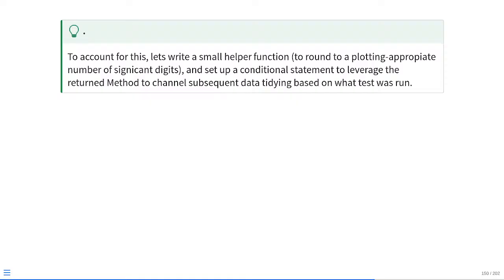So one way that we can handle this is there's going to be a lot of values that are not significant. So let's say our alpha value is 0.05. Basically, all the others that are above that point, we could just round them and convert them over to a character value that just shows as n.s, so not significant in our case. In which case, we could use that to build off of and handle things a little bit more.